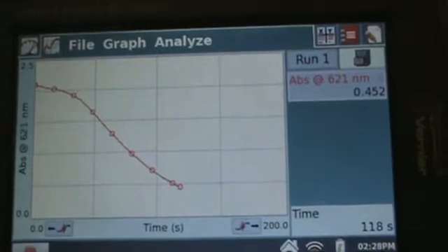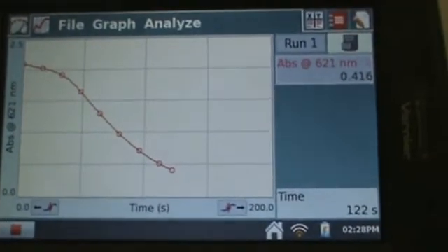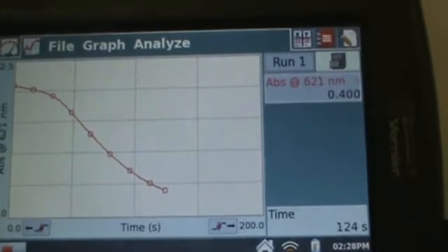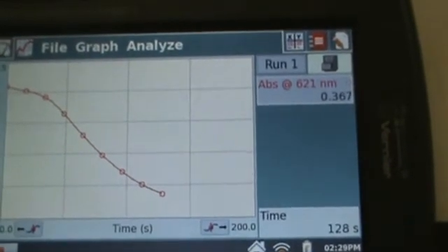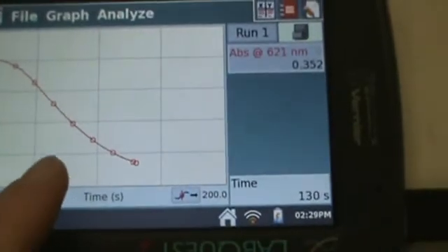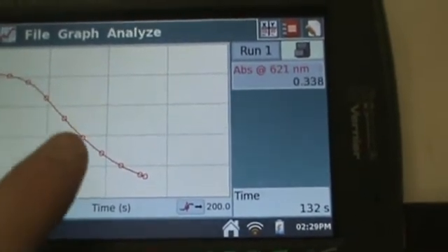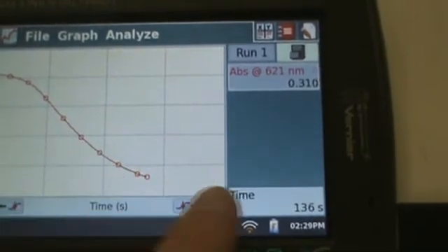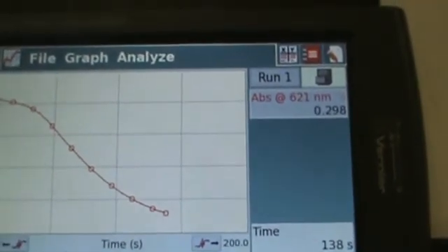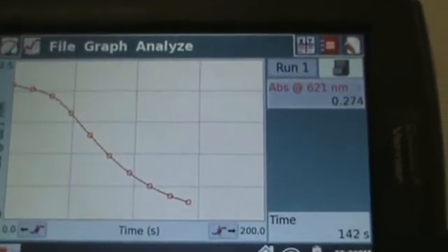If we go back over here and take a look, we can see that this was very dark at the beginning — not transparent at all. Now that most of that dye has been oxidized to the point where it's no longer interacting with light, it's been changed into something else. Our absorbance has gone from about 2-point-something down to 0.4-something — a major decrease, five times less concentrated than it was and still continuing to decrease. At this point we can confirm that we are not a zero order reaction; it would have just been a linear translation down, but instead we're seeing a tail off, telling us it's first or second order. We'd have to check that by changing our axes to figure it out.